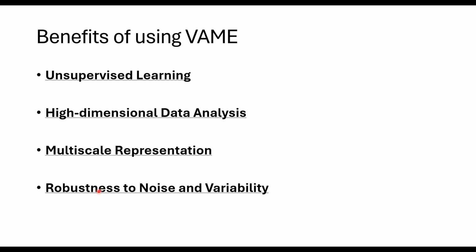In the multi-scale representation part, VAME provides great representations of multi-scale behaviors, allowing for detection of patterns at different time scales, short-term versus long-term. I do encourage you to check out their GitHub repo to learn more about how you can do these things.